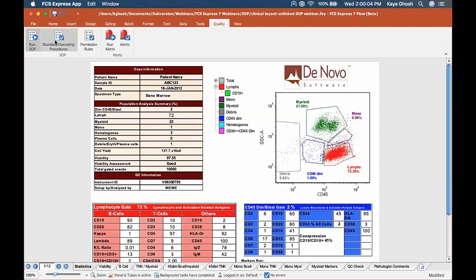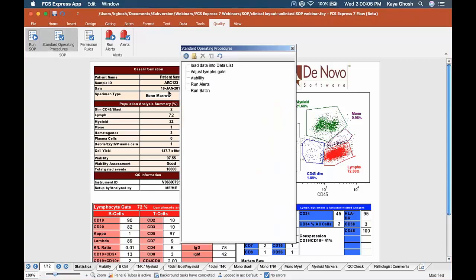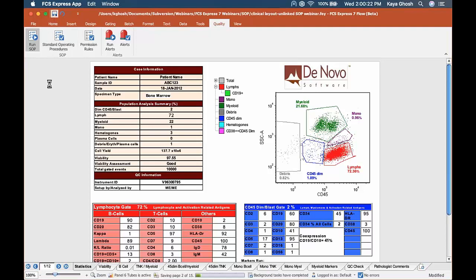what you need to do is come into the standard operating procedures builder here and click this little button here. You see the sort of recycle type of looking button here. And if you mouse over, it says reset SOP run status. So if you click that and then resave the layout, when you close and reopen it, you won't get that message, because what that's doing is it's refreshing the status. So that way the layout won't remember that the SOP has been previously run, either to completion or to partial, doesn't matter. Then you won't get that message.